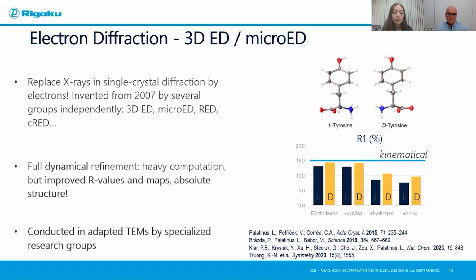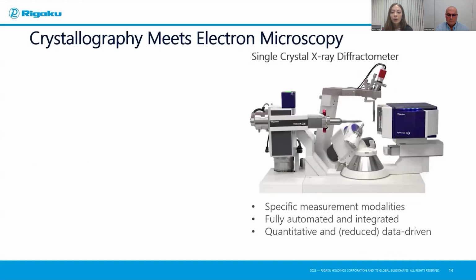And this technique of 3D-ED was really conducted in transmission electron microscopes that were adapted for use in 3D-ED by a handful of specialized research groups that needed both expertise in crystallography as well as electron microscopy. And that's where I want to bring up this point of crystallography meeting electron microscopy.